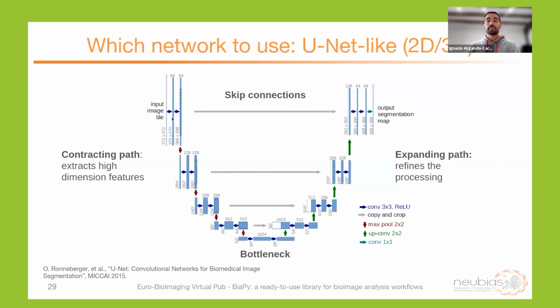And this type of network is used a lot, not only for segmentation, because imagine, the input is an image and the output is another image, so you can have the input image and labels, the input image and the noisy version of that image, or the super-resolved version of it, different channels, you can do pix2pix. There's a lot of possibilities for these networks. Even nowadays, all the image generation from text, at some point they have something like this to produce the final images. And this is something that we can use for semantic segmentation to get the object probabilities of our object of interest, in this case, mitochondria, could be anything else, at a pixel level, both in 2D and 3D.